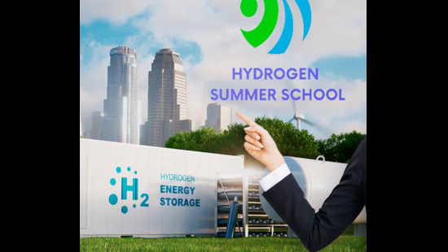Minimum production. Only generate the amount of hydrogen needed for the experiment. Avoid producing excess hydrogen gas to minimize the potential risk. Small-scale experiments. Keep hydrogen gas experiments small scale to reduce potential hazard. Avoid working with large volumes of hydrogen in a school lab. Safe storage. Store hydrogen gas cylinders or gas-generating chemicals safely, following guidelines for flammable gas storage.